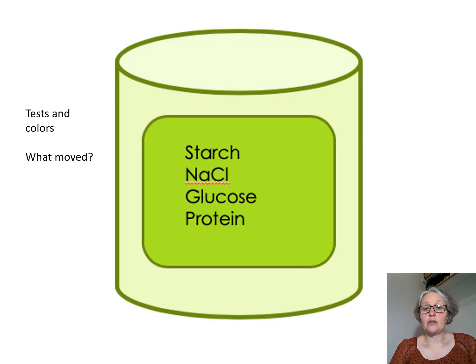Next in the PowerPoint, they set up the following reaction. They took dialysis tubing and filled it with starch, sodium chloride, glucose, protein, and they also mentioned filling it up with sulfate ions as well. They then allowed this substance to sit there for some time, and then they checked after time had passed to see if any of those 5 substances were able to exit the bag.